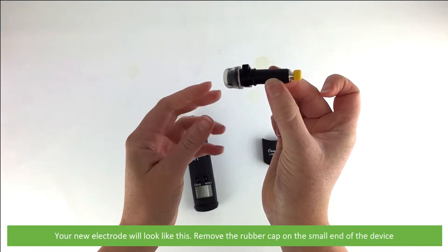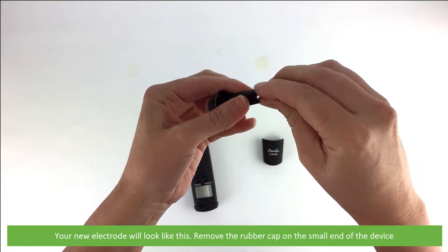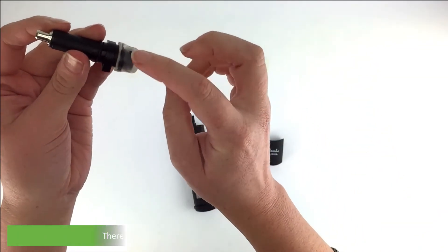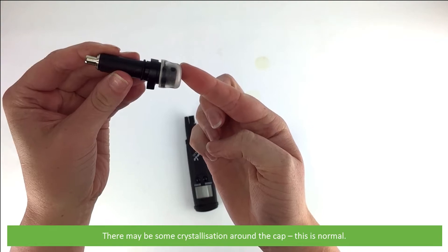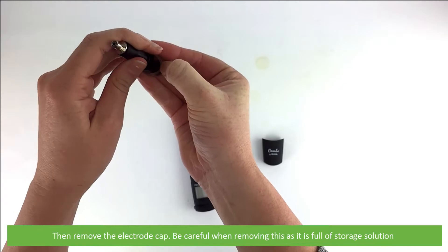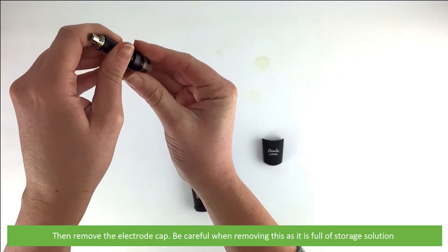Your new electrode will look like this. Remove the rubber cap on the small end of the device. There may be some crystallization around the cap - this is normal. Then remove the electrode cap, and be careful when removing this as it is full of storage solution.